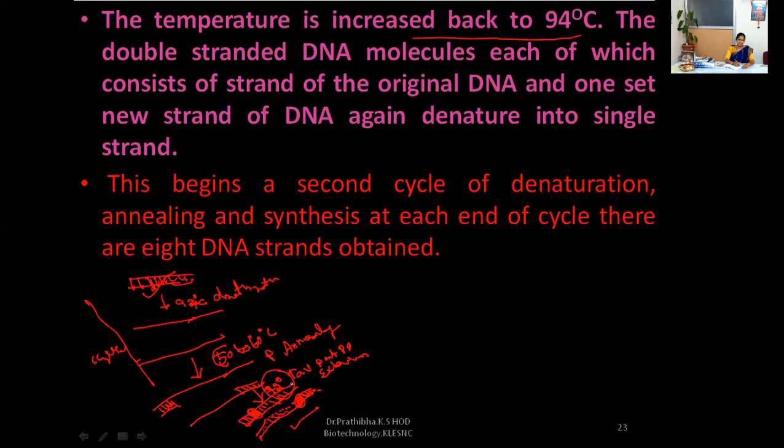Here these four strands are again subjected to the denaturation process. This strand will further go for denaturation, right? And this strand also goes for the denaturation process.